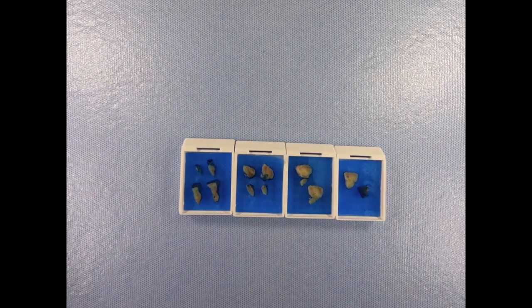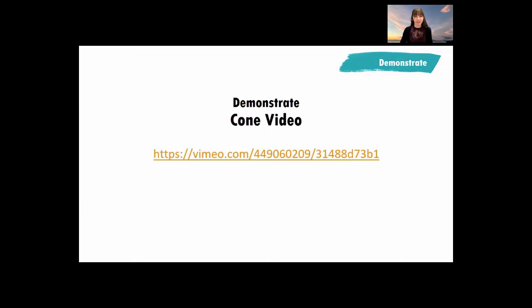This is the conclusion of the cervical large loop excision of the transformation zone specimen dissection video. Thank you for viewing. And finally, the third video will illustrate how to handle cone cervical specimens.